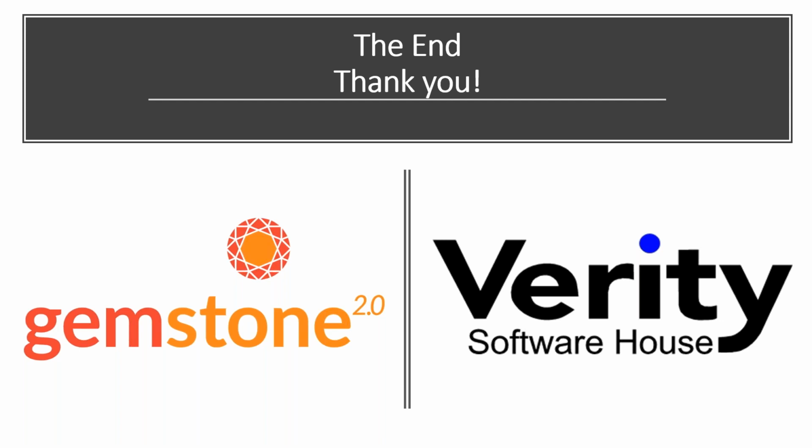We've done a lot of different cell types, a lot of different tissues, a lot of different samples, so we can always help you at Verity too. And we try not to encourage fishing experiments because most people don't, but we know we all do that. So there are different ways to do it, and we do have ways that we can help you do that.